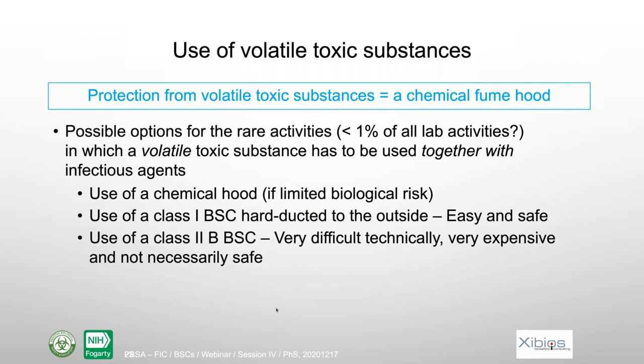With respect to volatile toxic substances, normally, volatile toxic substances need to be handled in a chemical fume hood. That's the protection for that type of hazardous substances. Actually, only for a very small part of biological activity, you might have to use at the same time an infectious agent and a volatile toxic substance. But that's very rare. It's probably lower frequency than 1% of all laboratory activities.